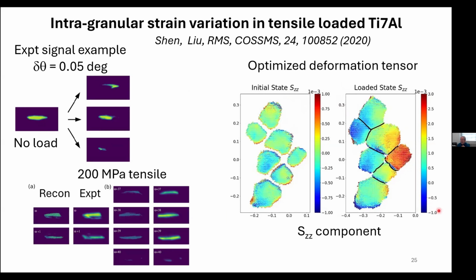Over here it looks like a compressive strain, and okay, so that difference, for example, Armin Bodwin suggested that the sample was a little bit bent, so that when we pulled on it, it compressed one side here and stretched the other side here. But you also see that there's a variation within the grains, and that's what we're after.